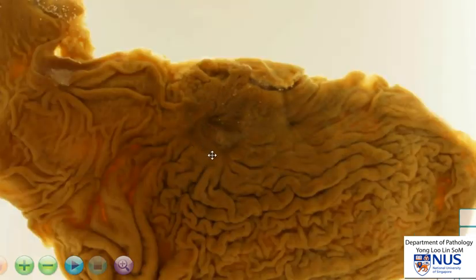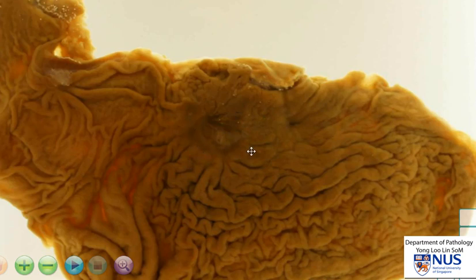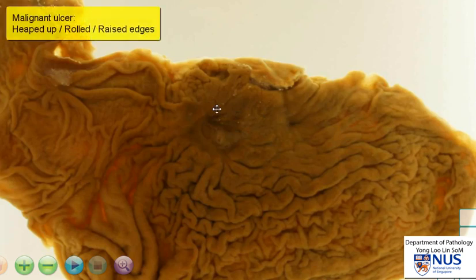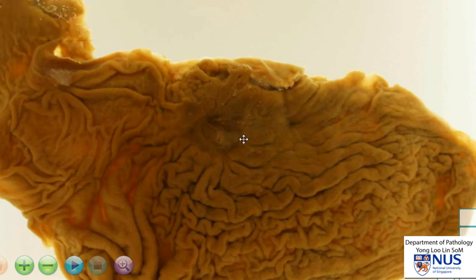The edges of the ulcer appear to be relatively flush with the rest of the mucosa. They are not heaped up, raised, or rolled up. If we see heaped up edges, we're always worried about a malignant ulcer — in other words, a cancer that has ulcerated. So in this instance, there are no worrying features of malignancy.